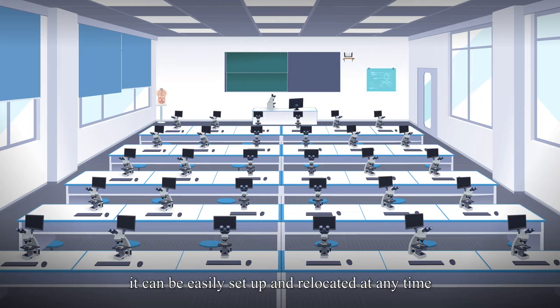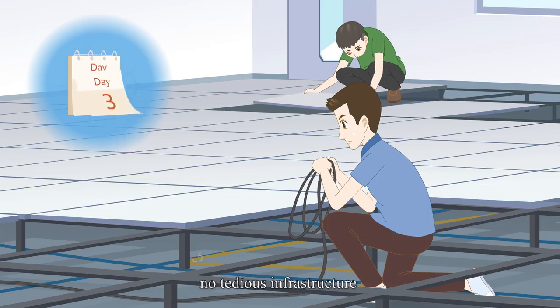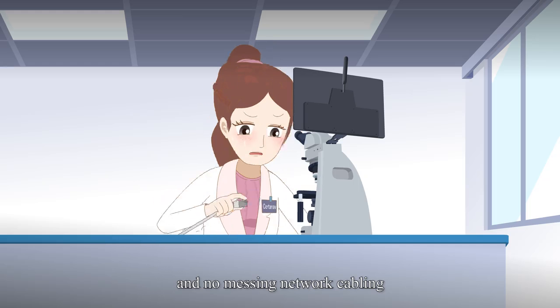It can be easily set up and relocated at any time, no extra physical constraints, no tedious infrastructure, and no messy network cabling.